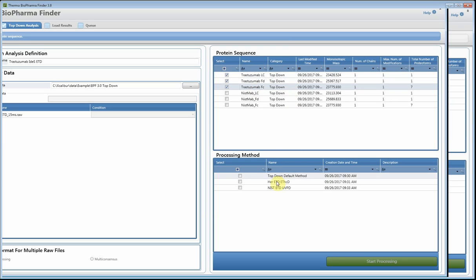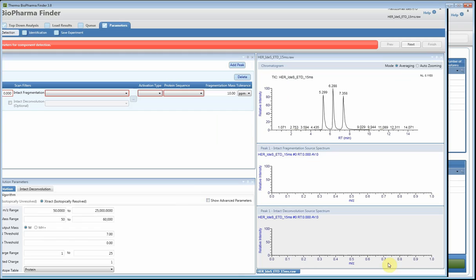I'm going to select all three sequences — the light chain, the Fd, and the Fc — and pick our default top-down method to begin. When you start processing the top-down workflow, you define your peaks; each peak is then deconvoluted, and the deconvoluted MS/MS spectra are sent to the ProSight engine. The search results are then returned to the software for display.